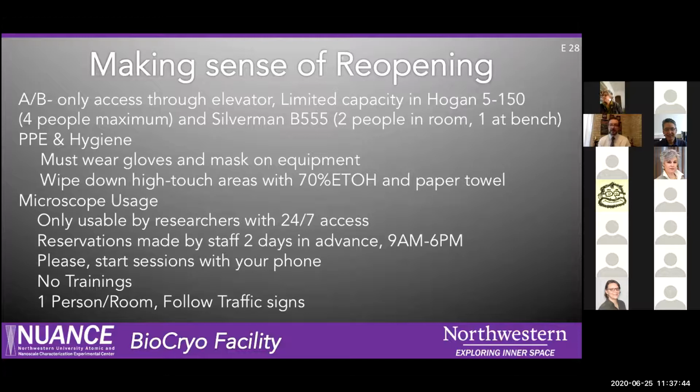In Silverman, it's a little bit more tight. In B555, I have my bench there, and there is the workstation for accessing data. Technically, there are 2 people allowed in that room, but if you're over by the bench, it's really just one person over there. So if you're there and you see a couple of people come in, feel free to flag them down and say, hey, no. People do come in to use the minus 80 freezer in there.